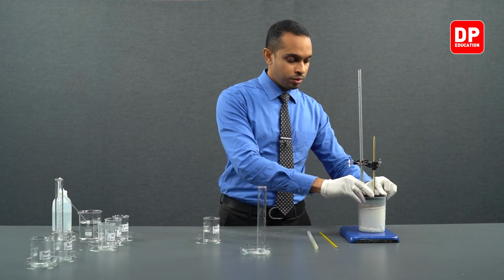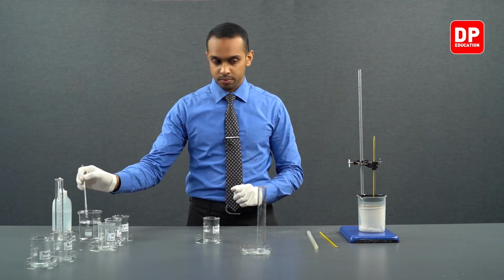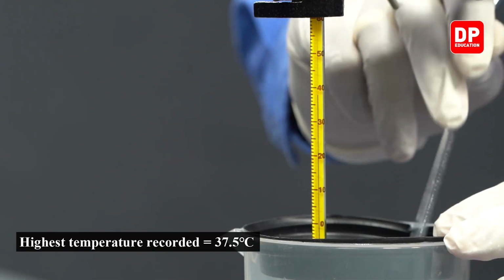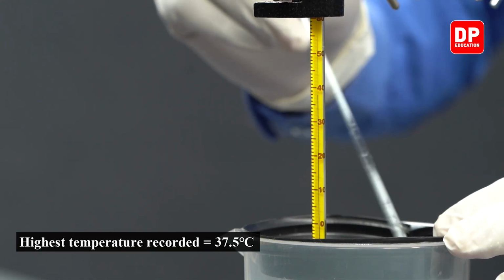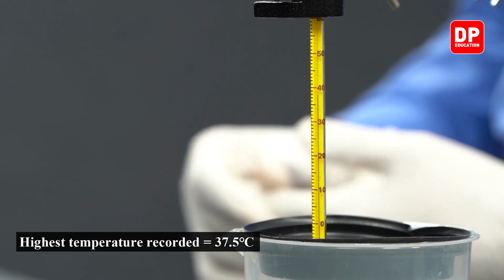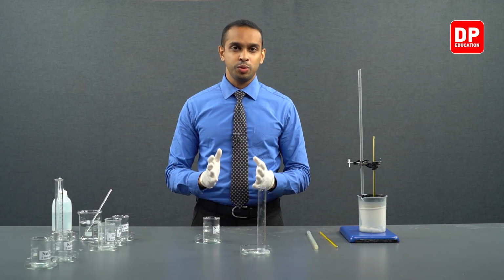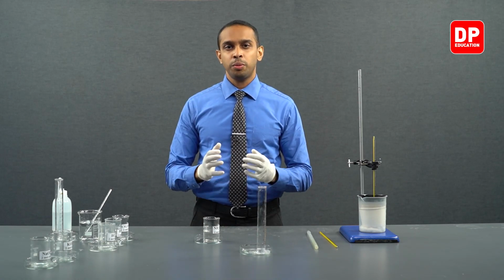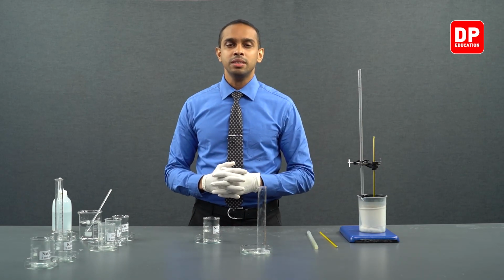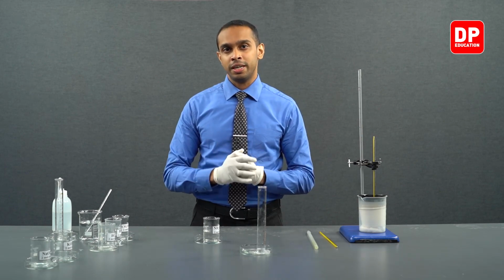And now you can see as the reaction proceeds, the temperature starts to increase. Now we can see towards the end of this reaction, we observed the temperature going up and coming down, and the highest temperature that this reaction mixture reached was 37.5.